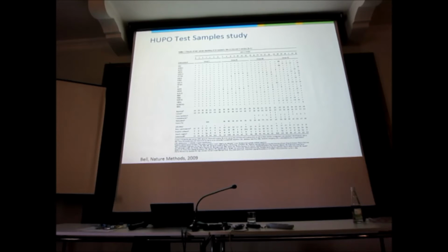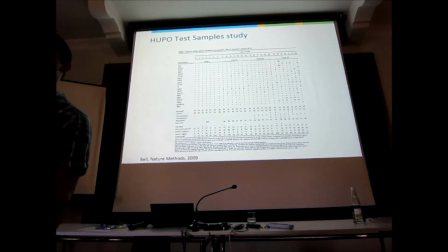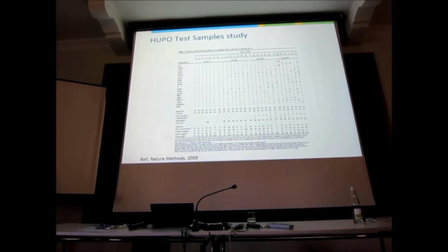They took a bunch of human proteins, chucked them in a sample, and told people, so this is like an accreditation sample. Nobody knew what was in there, but they were equimolar. And they shoved the sample at people with how many proteins? About 20-ish. And they said, analyze anything you can and give us back the results. Okay? So people analyzed and gave back the results. And now there is the test of how many of these did you get right. These are the different groups that participated, anonymous. And these are the different proteins. And a plus means you found it, and everything else means something was wrong.